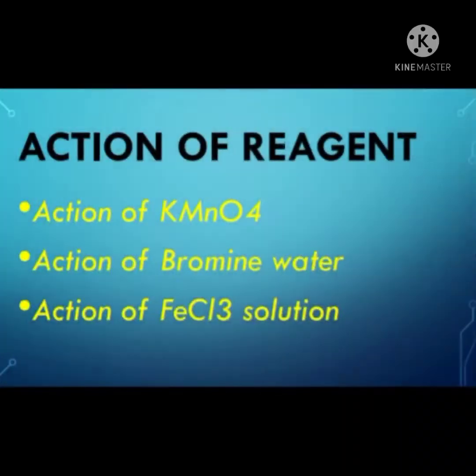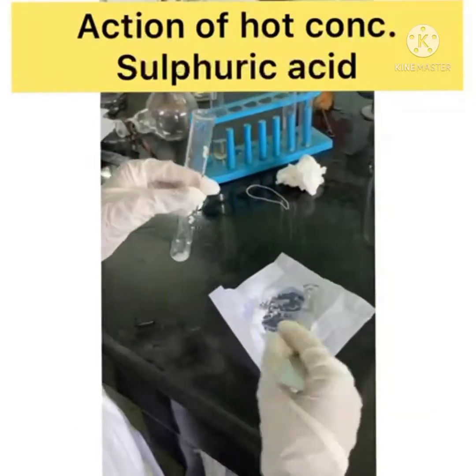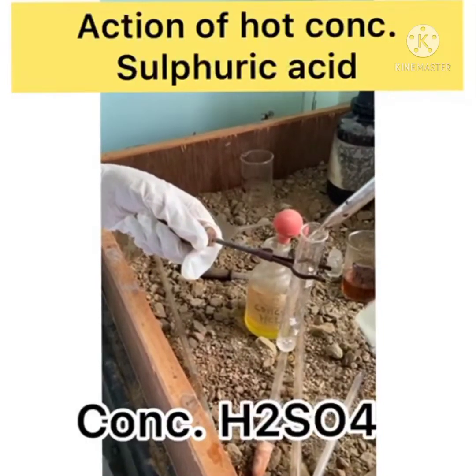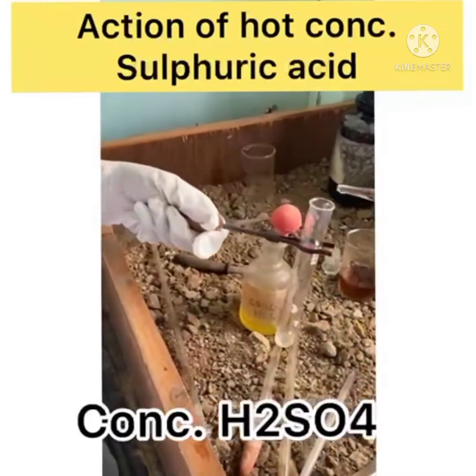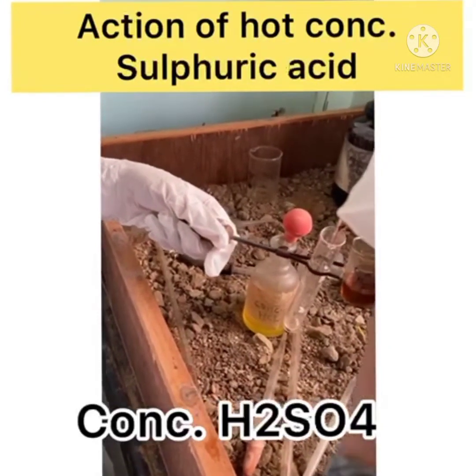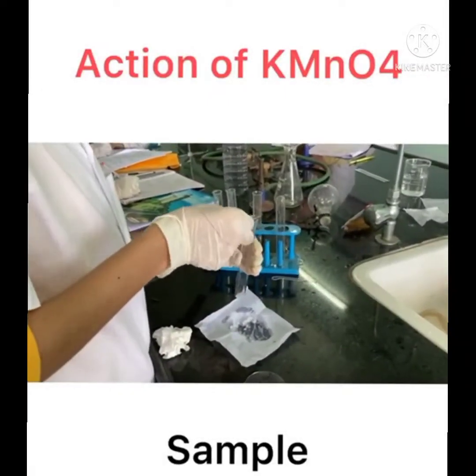Action of reagent: in this test, we take 0.1 gram or 2-3 drops of sample and water in a test tube, then add 1 ml of concentrated H₂SO₄ acid at cold temperature. Then warm the mixture. Observations are: no effervescence, no blackening, but a pungent odor.